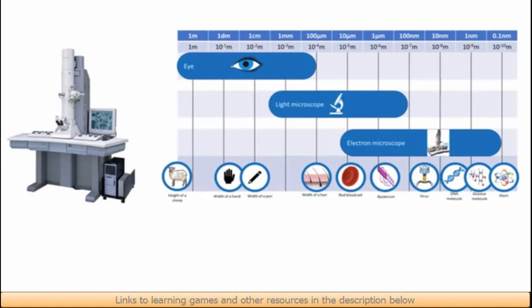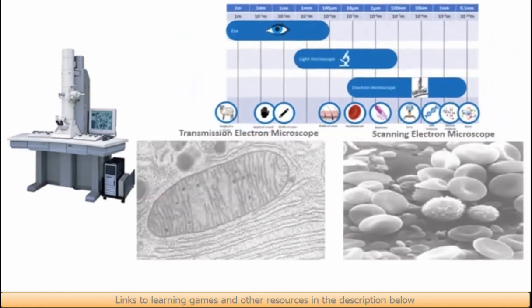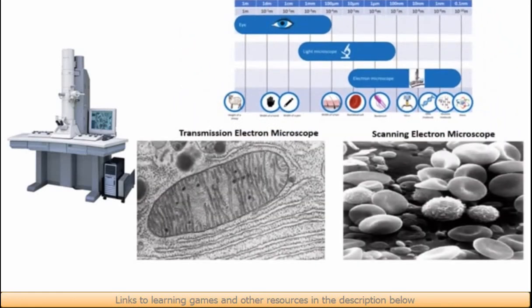There are two types of electron microscope. In transmission electron microscopes, electrons pass through the sample. These are used to examine very thin slices of objects, similar to the sections that are shaved off a material onto the slides of a light microscope, but much thinner.